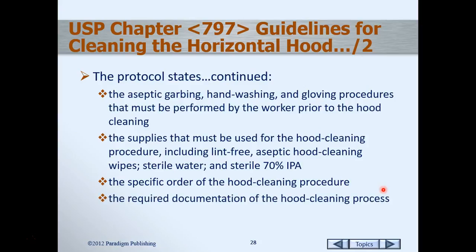The whole process requires documentation of the hood cleaning process, because as I've stated previously, if it's not documented, it didn't happen.